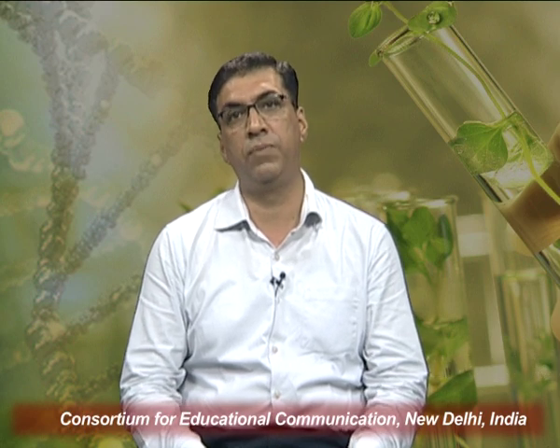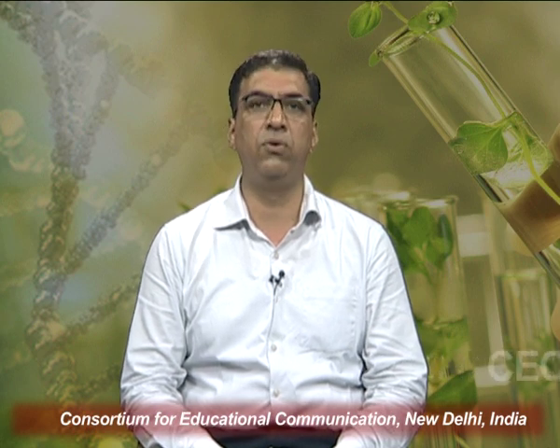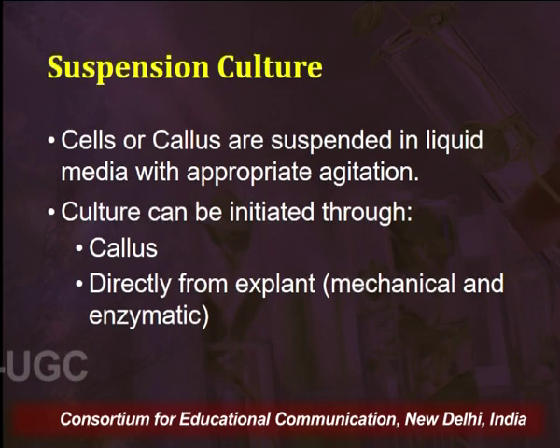Again, it will depend upon the type of plant you are using and the type of initiating cells you are using. In suspension culture, we can initiate by using cells obtained from callus. We first disintegrate that callus into smaller groups of cells, or preferably single cells, and then suspend them in the liquid media. Or we can directly use the explant material.